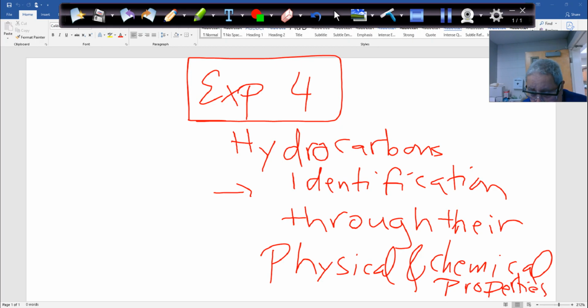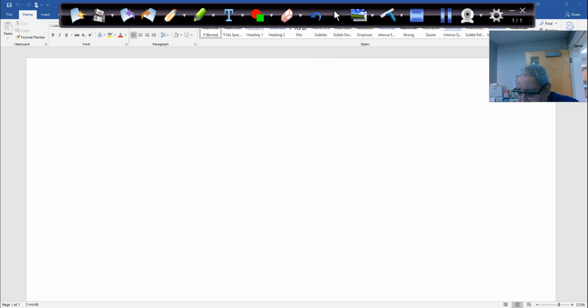So, what we'll have here, we'll have 3 hydrocarbons. And the 4th one will be your unknown. Your unknown will be one of those 3. So, let's see here. What are those 3 hydrocarbons? Well, we'll have a cyclic.